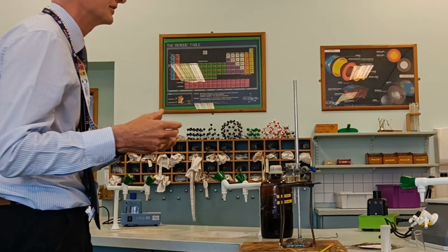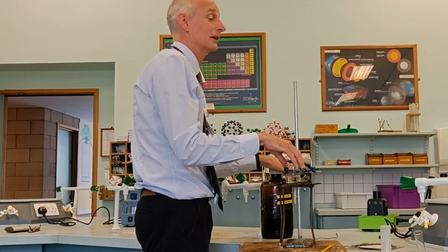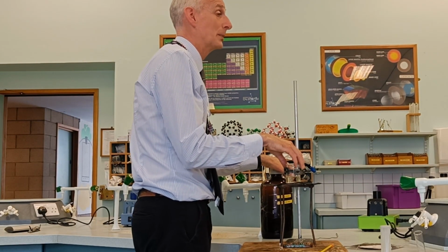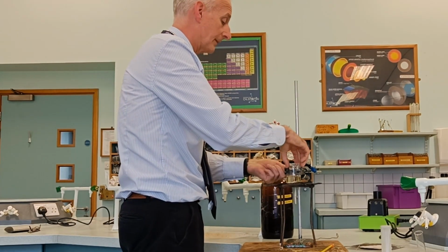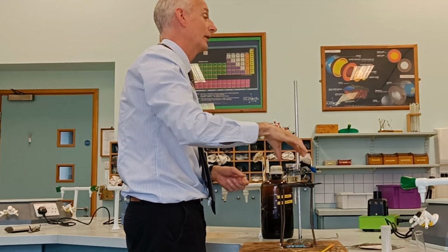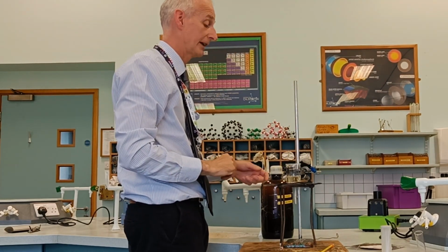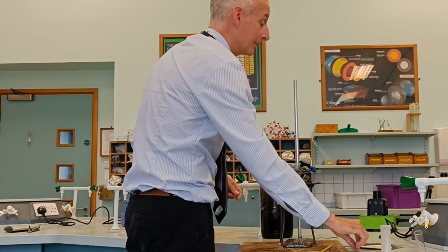So the thing I'm going to heat it up with is glycerol. Glycerol is the standard name for propane-1,2,3-triol. So this is glycerol, and I poured some in here. It's quite gloopy, and its boiling point is well above 100, so I can get it above 100. So how am I going to heat my sample?